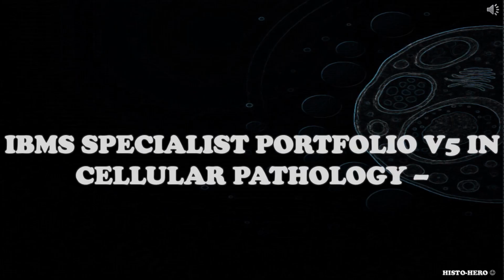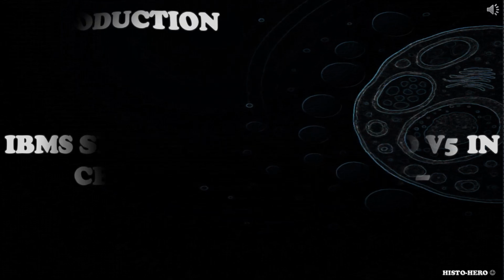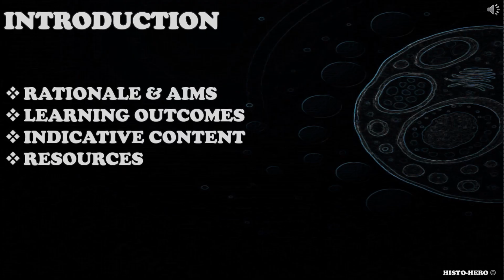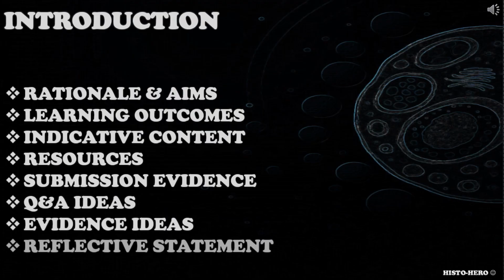And today's video will be about microtomy, which is part of the IBMS specialist portfolio in cellular pathology. So, just a quick introduction to this video. It will be short and sweet, I promise. I will discuss rationale and aims, learning outcomes, indicative content, resources, submission of evidence, Q&A ideas, evidence ideas, reflective statement, and some helpful tips to make candidates' portfolio better.